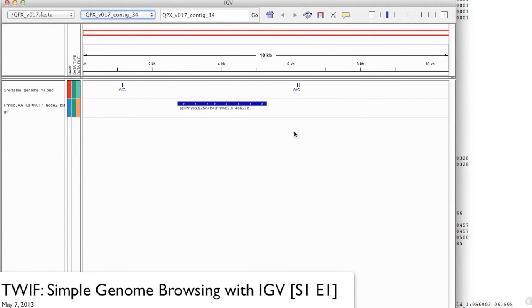And then finally, I just want to show a way to look at RNA-seq data, which is very interesting. So I created an RNA-seq file in CLC, exported it as BAM out of CLC, and then just used genomeCoverageBed in bedtools to create a bedgraph. And this is what the bedgraph looks like. It's got the contig name, location, and then just the coverage number. This would be very low coverage.